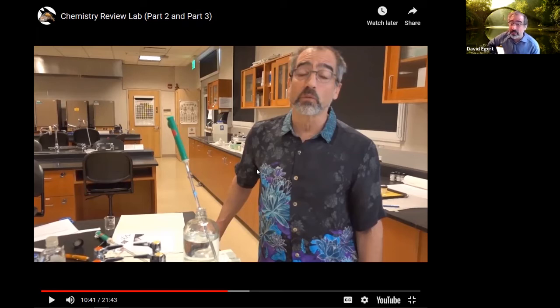It's not uncommon when we do this lab in person where somebody will mix salt with water and then write their description. Oh, it looks kind of like an oil slick. And they'll just write it down and move on. And it's like, all right, slow down. Wait a moment here.